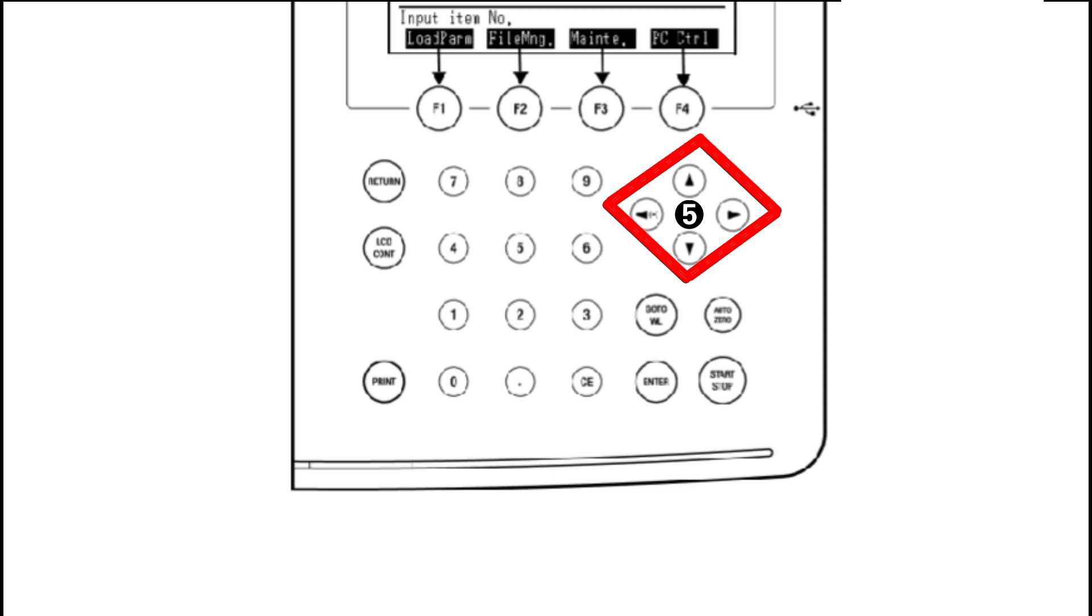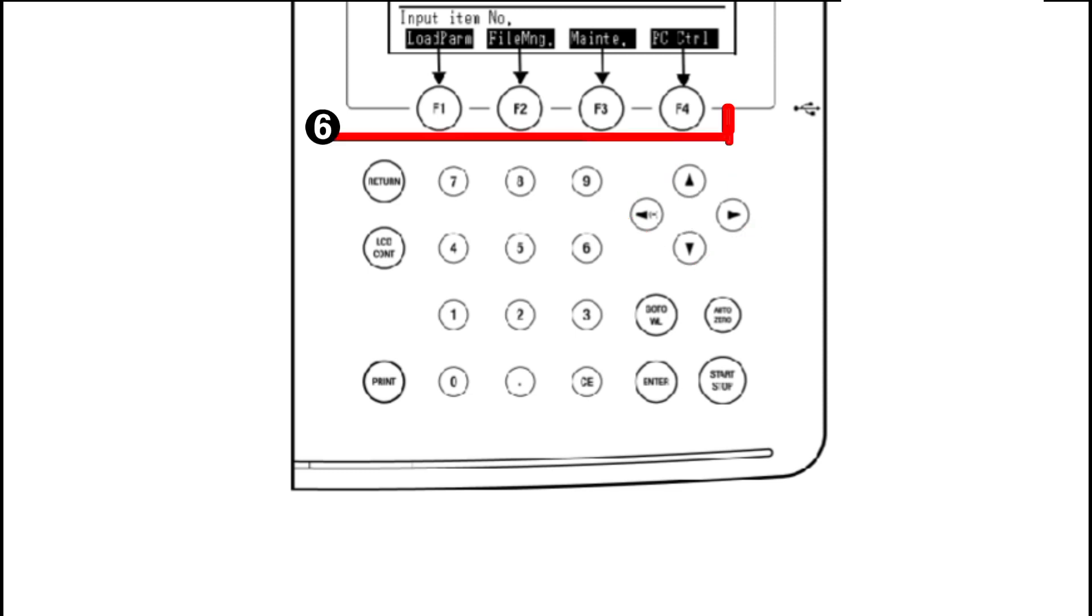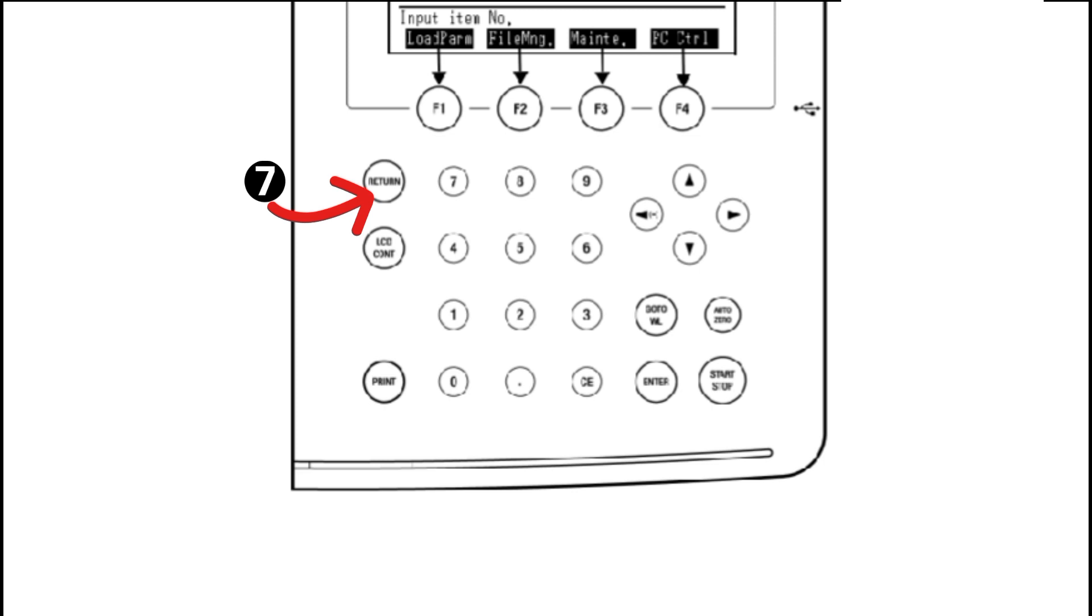Number six is the F1, F2, F3, and F4. These are basically the functional keys displayed at the bottom of the screen. Number seven is the return key. When we press this key, it is used to display the previous screen.